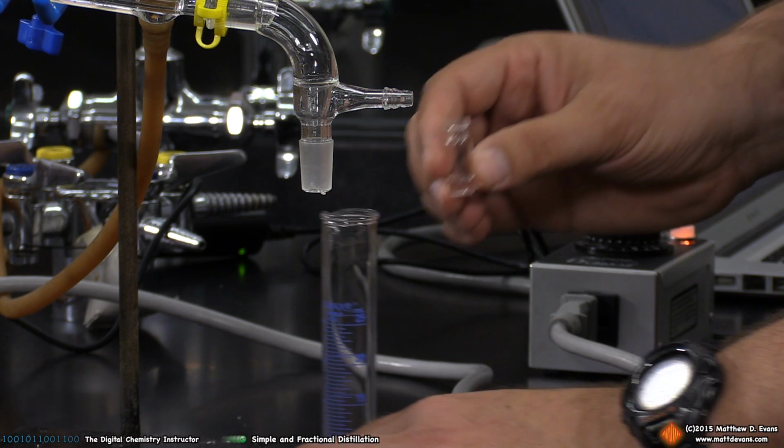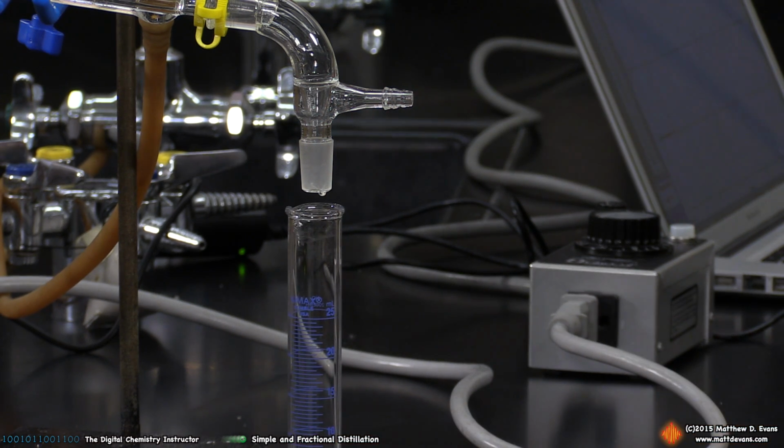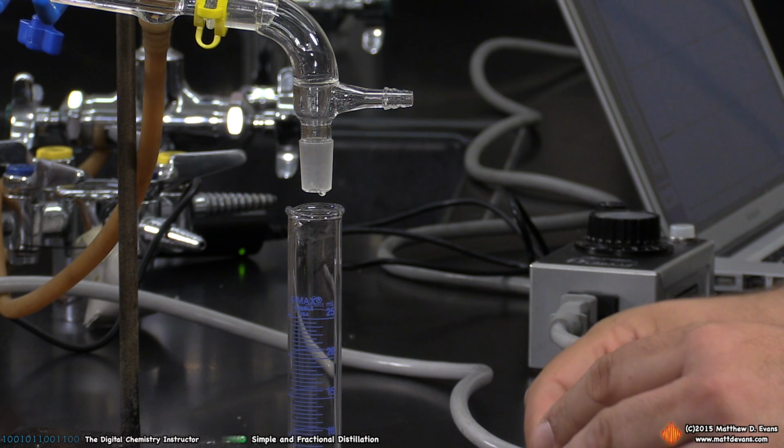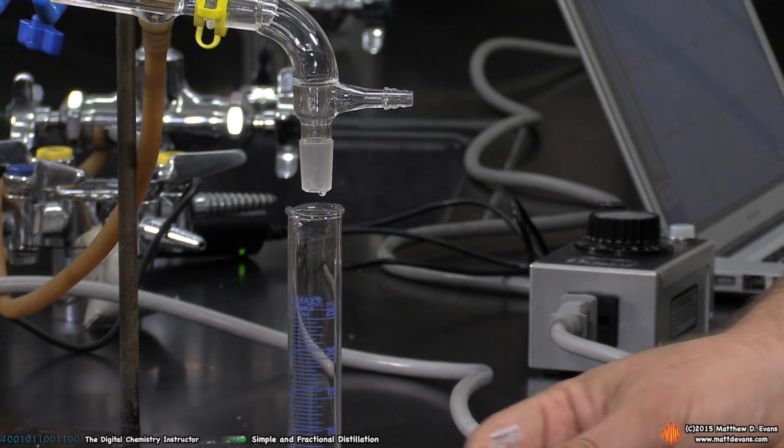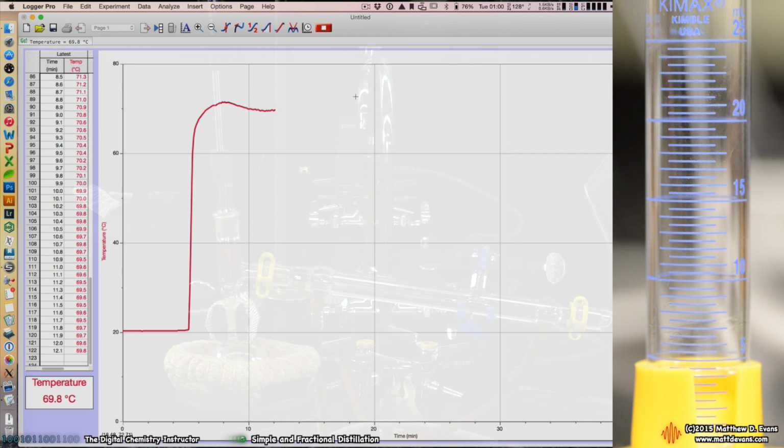Okay, we've got enough in our little auto sampler vial that we can go ahead and use this in the GC later. So I'm going to cap this up. Make sure you keep track of which sample this was. You'll need to make a note of the fact that this is a simple distillation, but also this is the 4 milliliter mark. Make sure you make a note of that. I'll probably end up having a sign-up list for the gas chromatograph, but this is our first sample.